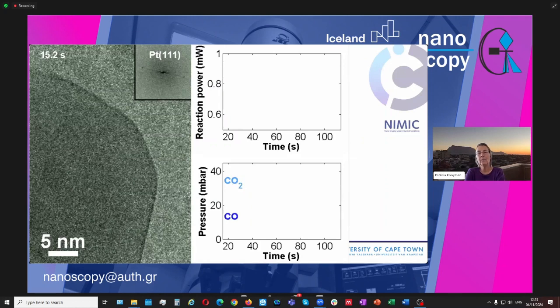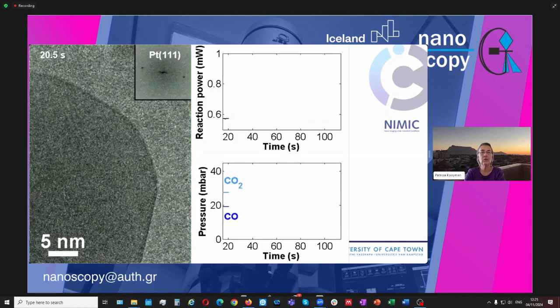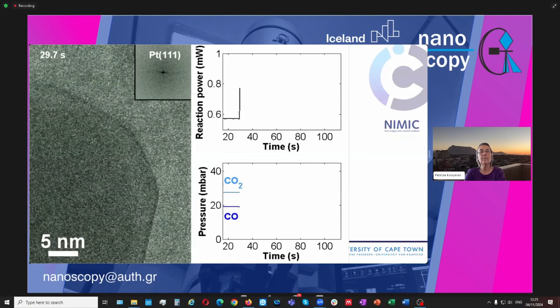And at Haldor Topsoe, there was a mass spectrometer available. So we also plotted the concentrations of, or the mass spec signals of, carbon monoxide and carbon dioxide. Because we had such a big surplus of oxygen, that's completely out of scale, so we left that out, and it's only a small fraction of the oxygen that reacts anyway.